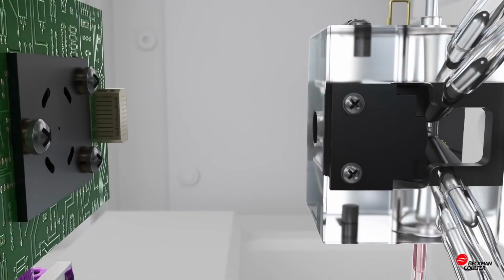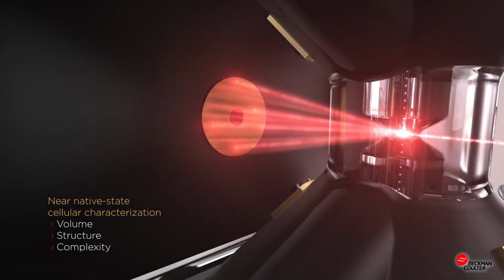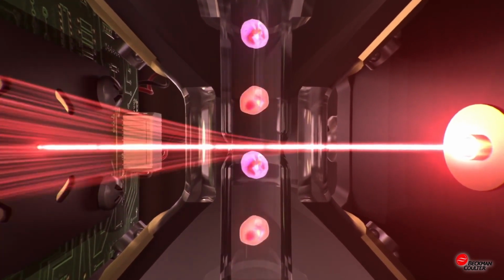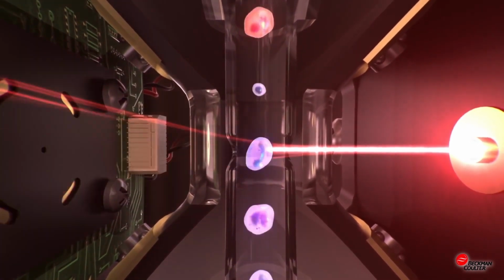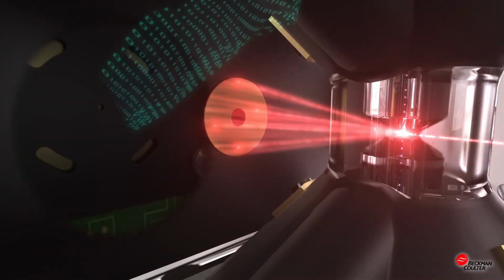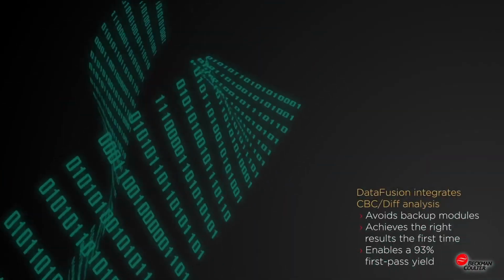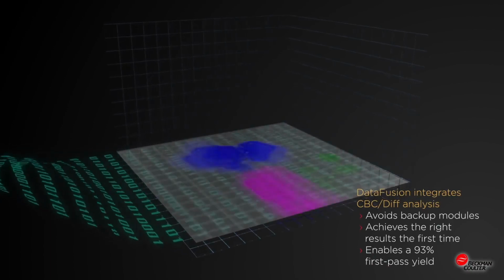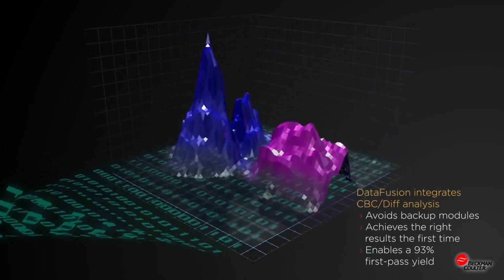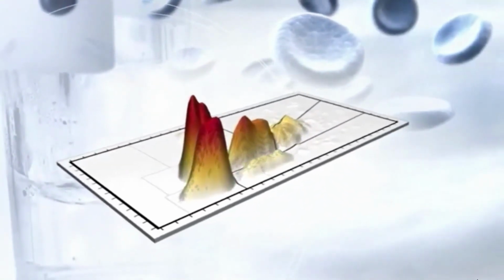Flow cytometry is a technique used to detect and measure physical and chemical characteristics of a population of cells or particles. In this process, a sample containing cells or particles is suspended in a fluid and injected into the flow cytometer instrument. The sample is focused to ideally flow one cell at a time through a laser beam, where the light scattered is characteristic to the cells and their components. Cells are often labeled with fluorescent markers so light is absorbed and then emitted in a band of wavelengths. Tens of thousands of cells can be quickly examined and the data gathered are processed by a computer.